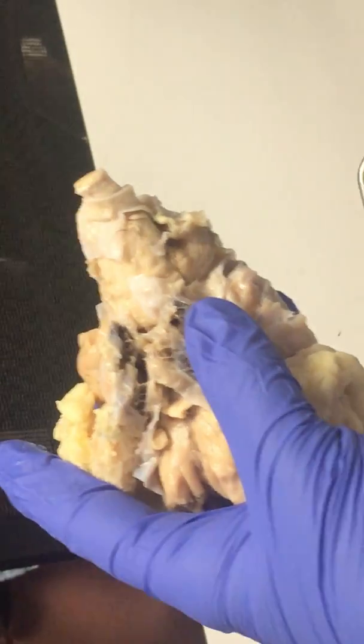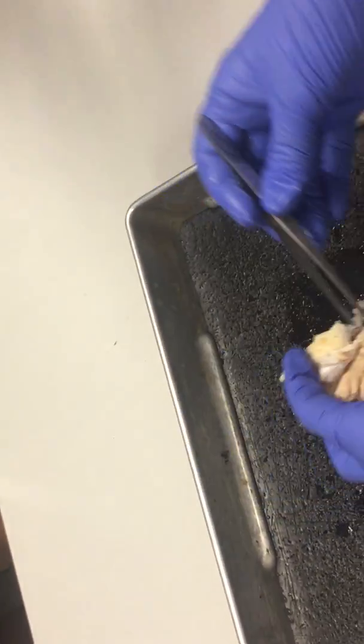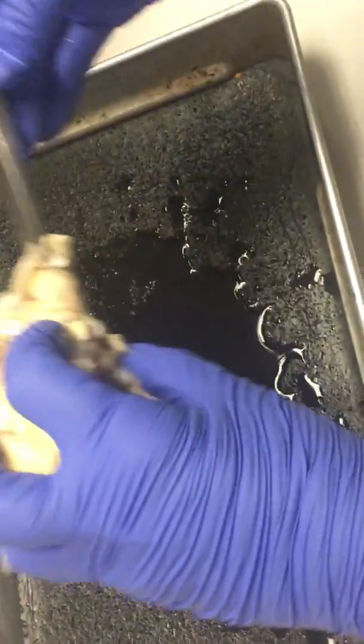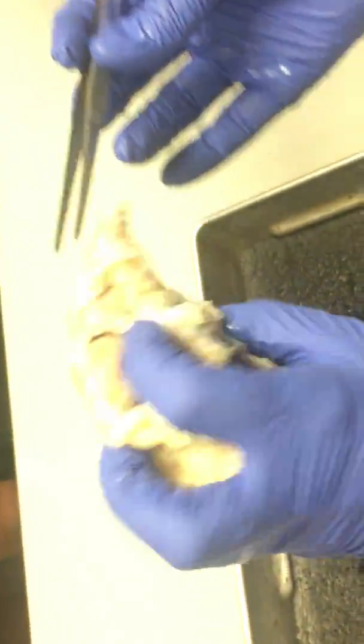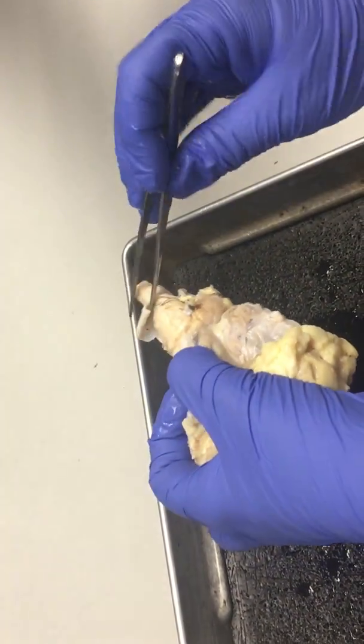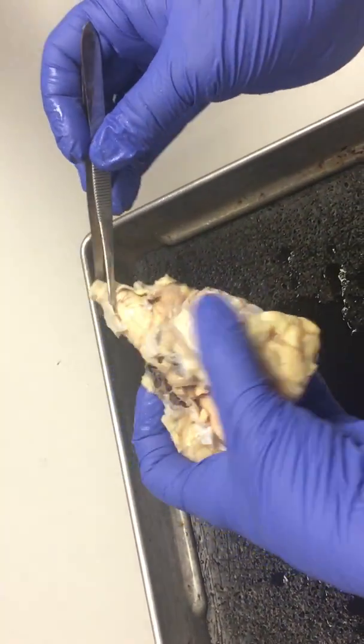You guys can come over here and look over my shoulder. Here's the cerebellum here. So, this part is the pons and the medulla oblongata. And we'll clean it up a little bit so we can see better which part is which.